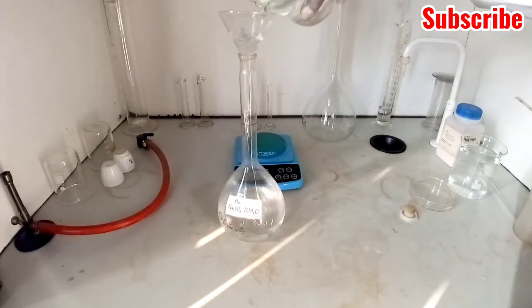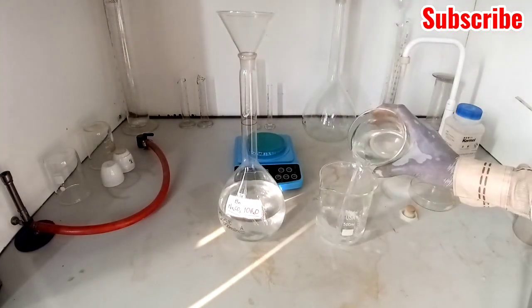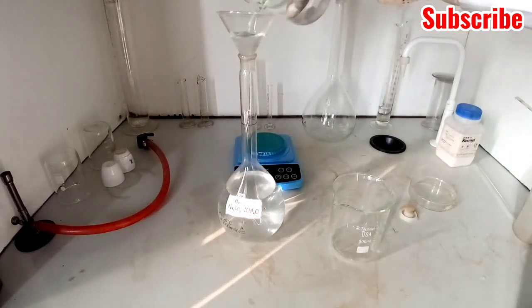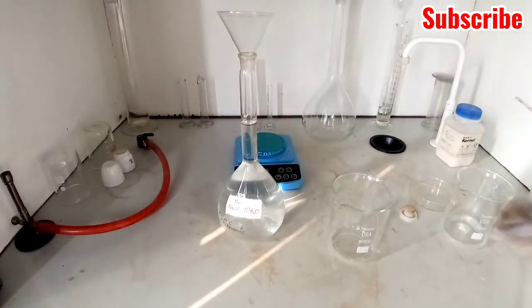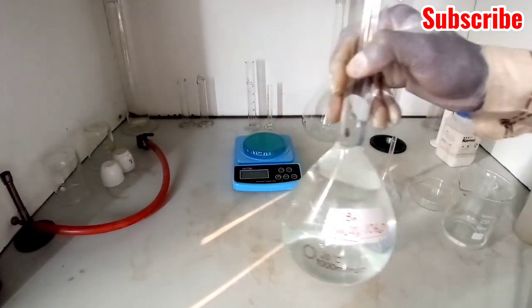After that, you turn it into your standard volumetric flask and dilute to the 1000 mark, that's 1000 cm cube. So this is our Bn, which is 0.0175 mole per dm cube.